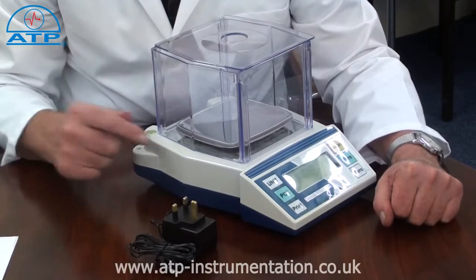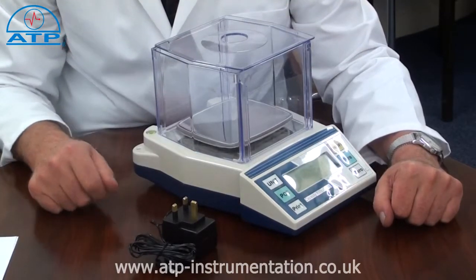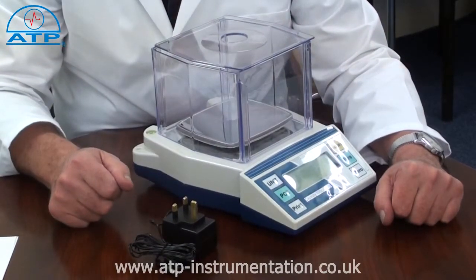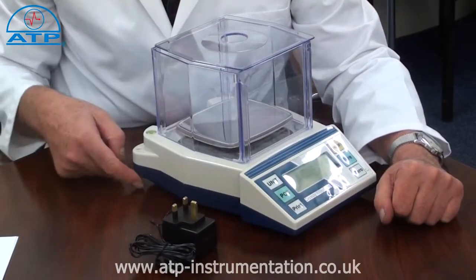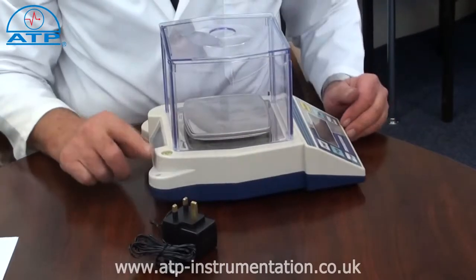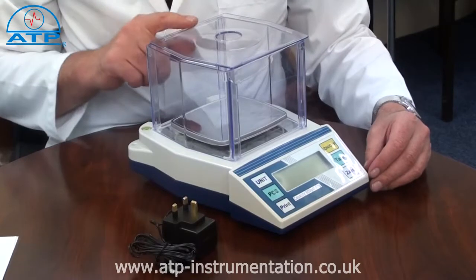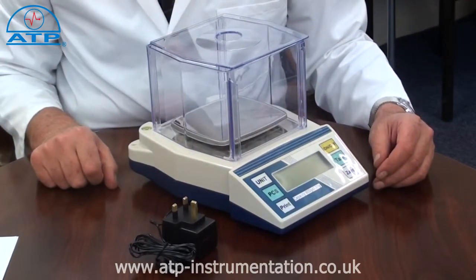The platform is stainless steel, measuring 135mm by 120mm. The scale has adjustable feet with a bullseye level bubble. The draft shield is included for operation in unstable working environments.